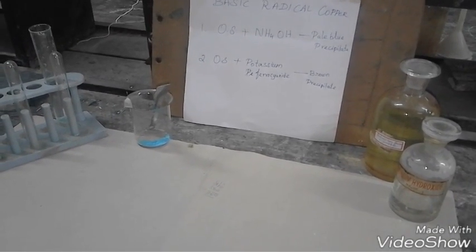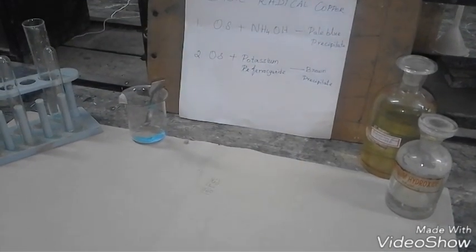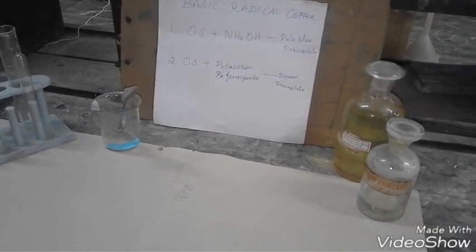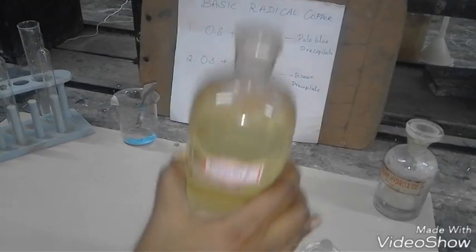Now take the other test tube. To a small amount of original solution, potassium ferrocyanide is added. This is potassium ferrocyanide.